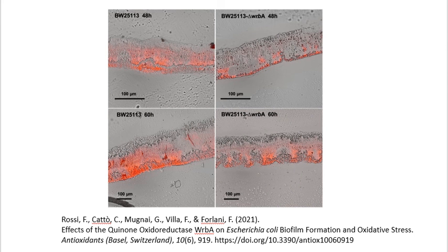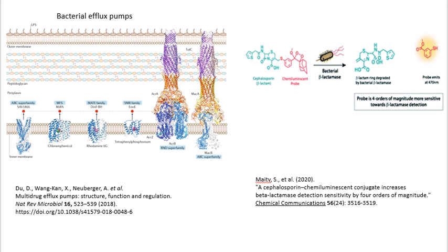I proposed that this increase in WRBA proteins gave evidence for the formation of biofilm as well as the presence of RAPA peptides in all samples, which is a protein identified to be present in biofilms but not their associated planktonic cells. In bacterial antibiotic resistance, the formation of biofilm is generally coupled with increased expression of efflux pump genes. Many of the proteins involved in efflux pumps were found to actually decrease in abundance, but none were deemed statistically significant by either quantification platform.